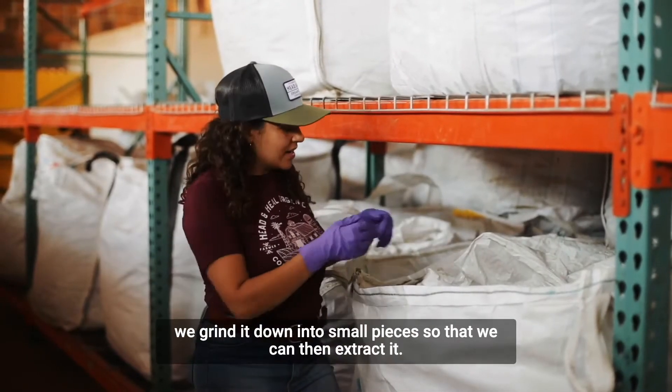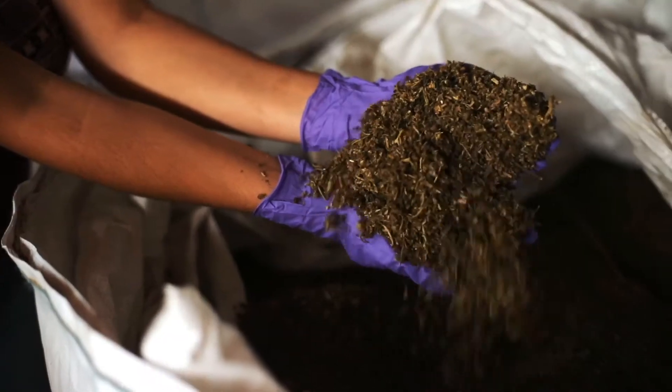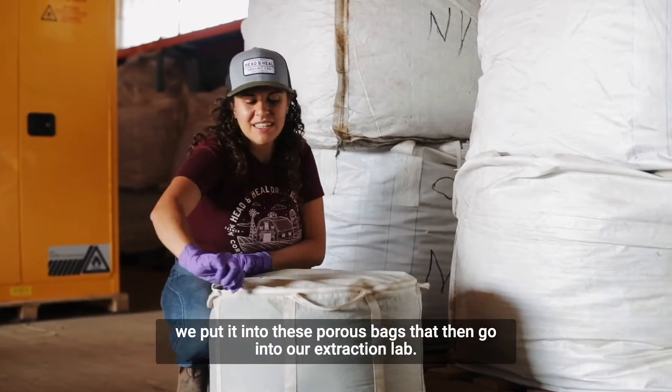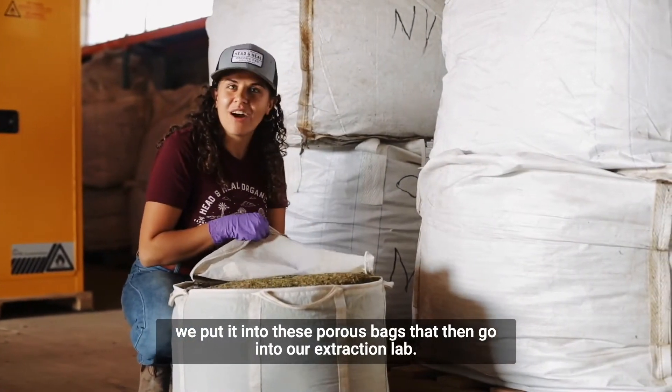After the hemp is dried, we grind it down into small pieces so that we can then extract it. Once the hemp is ground up, we put it into these porous bags that then go into our extraction lab.